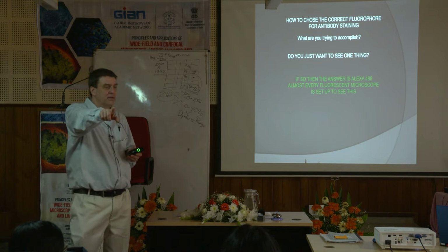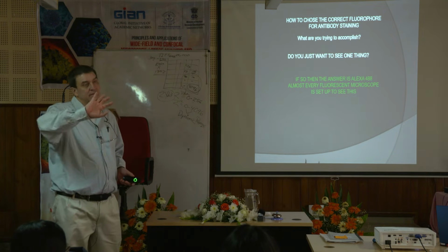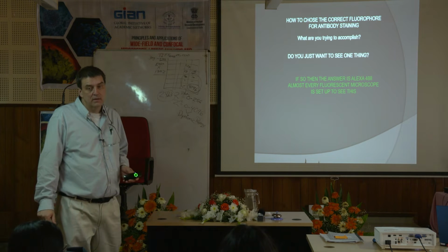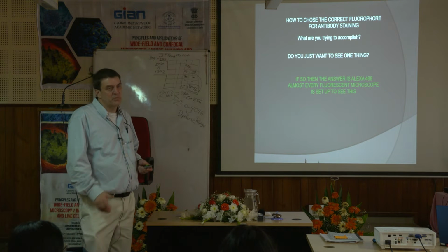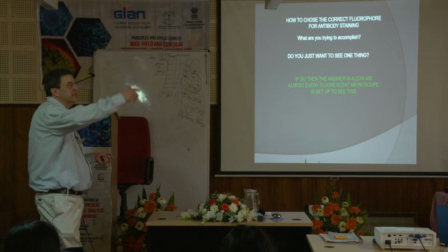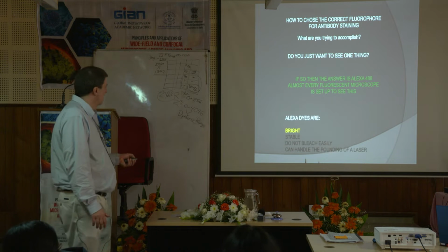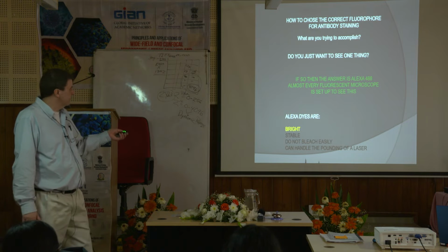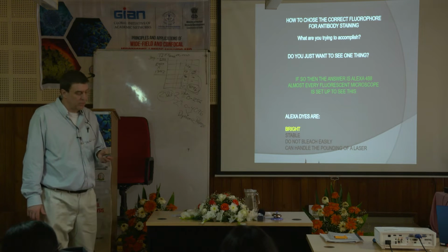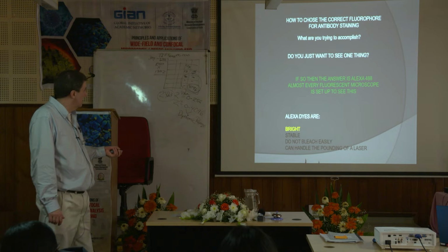Now the drawback would be, whoever talked to me about autofluorescence earlier, again, like I said, you want to work more out in the red because autofluorescence tends to be the worst in green. But for one dye, a simple experiment looking at one protein, I like this dye. And like I said, most microscopes, because if you had to go to your friend's institution or take it somewhere else too, chances are this one will work for them. Again, Alexa dyes are very bright, they're stable, they do not bleach easily, and they can handle a laser beating on them. They will bleach, but you really got to go after it to make it bleach. I like them a lot.